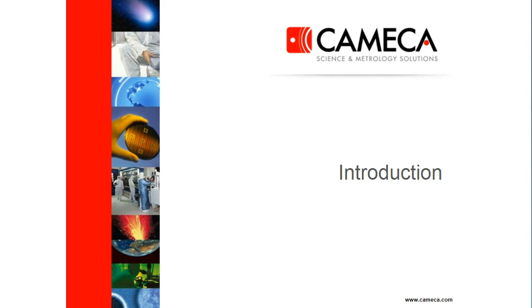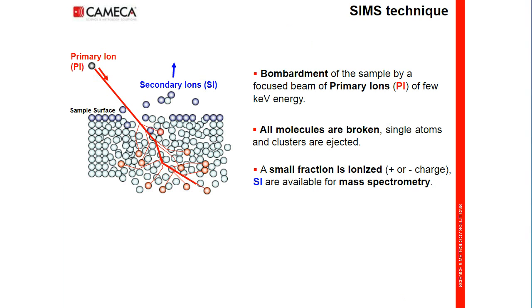A brief introduction about the SIMS technique and instrumentation. When a solid sample is sputtered by primary ions of a few keV energy, a fraction of the particles emitted from the target is ionized. Secondary ion mass spectrometry, SIMS, consists of analyzing the secondary ions with a mass spectrometer. SIMS is a destructive technique by its nature, as it is based on sputtering of material. SIMS provides a local analysis of any type of solid material that can be kept under vacuum.